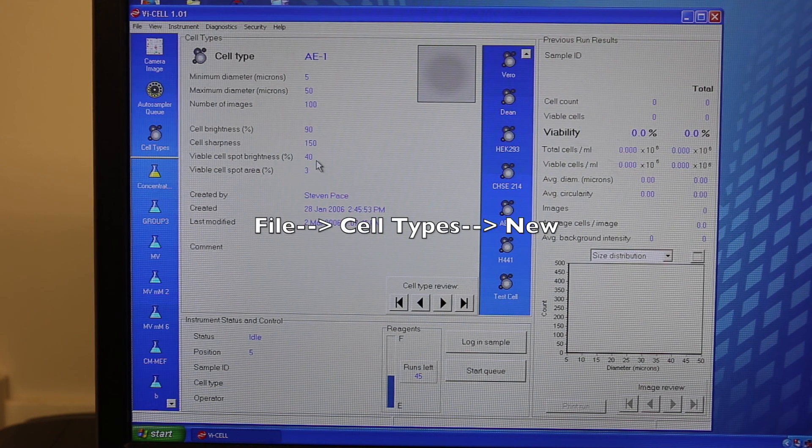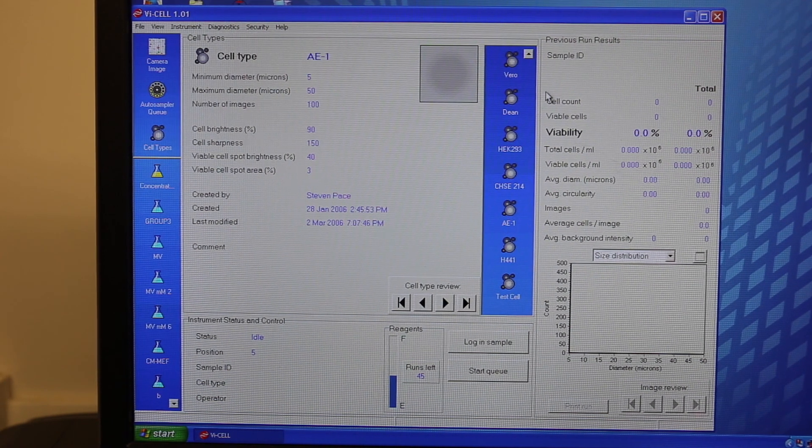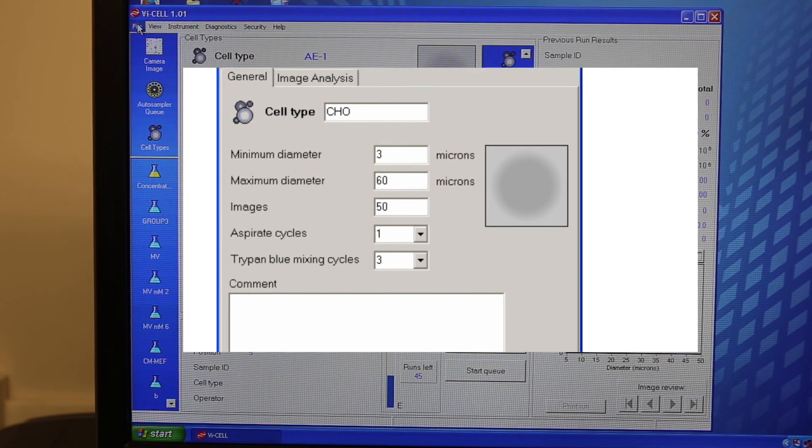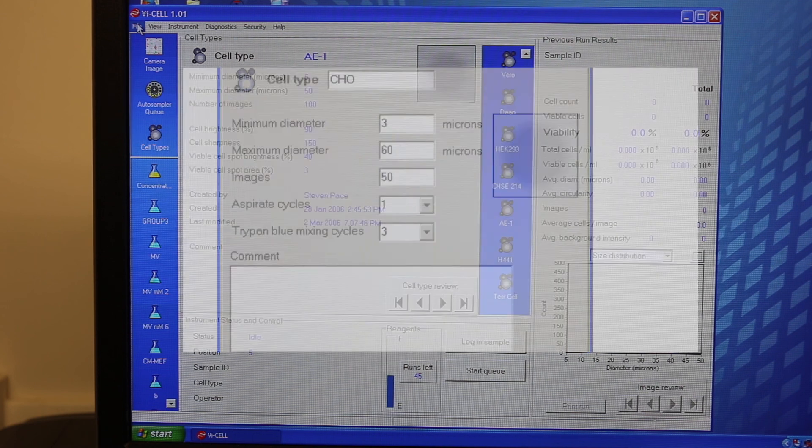In this area you will be able to type the type of cell as well as the minimum and maximum diameter and the number of images you wish to take of each of the cell samples.